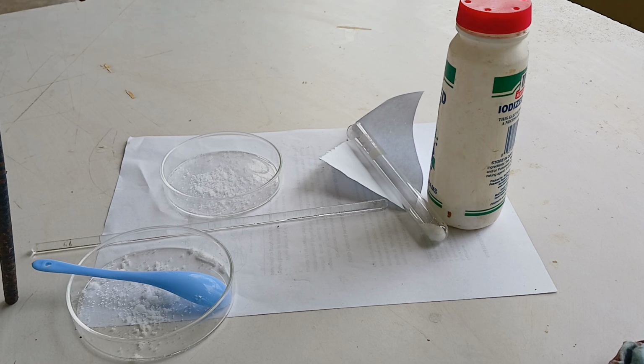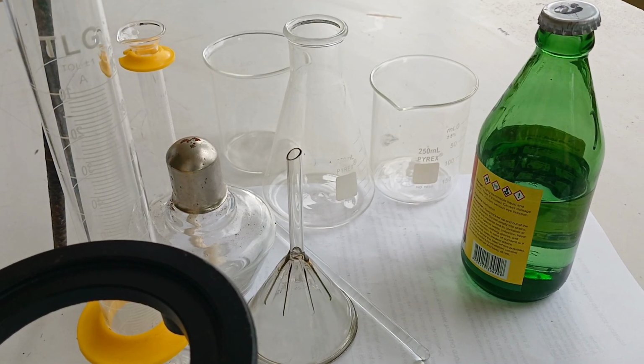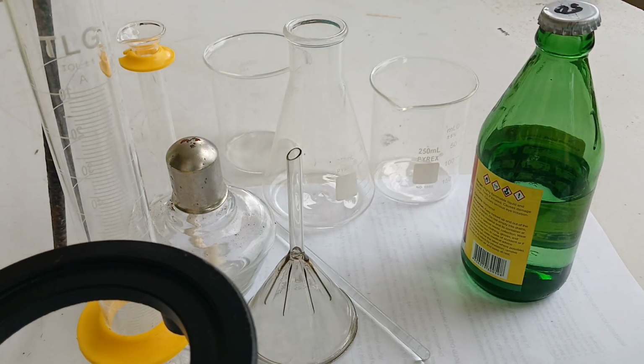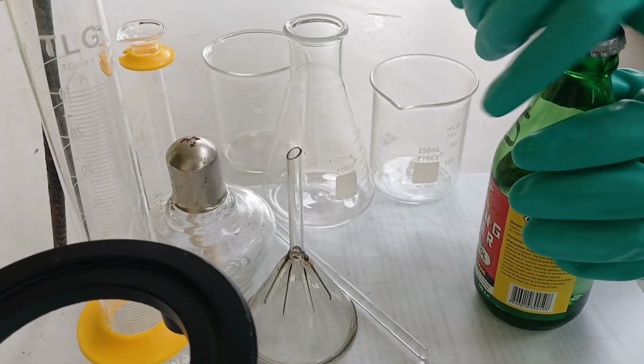Well, actually, if you are very skillful and you have initiative, there are so many ways to transfer. Those are the most basic strategies and methods. By this time, we have liquid. How to transfer liquid to another container?